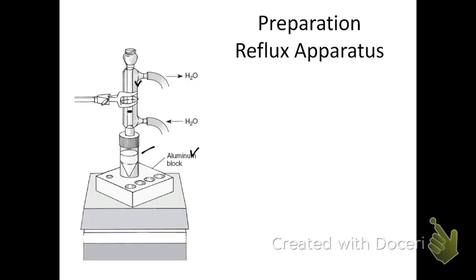That's kind of the double-edged sword, because really what you want to do is get the reaction hot and allow the reaction to proceed to completion, or towards completion, as much as you can. But at the same time, if you make it too hot, bad things can happen, like loss of product, decomposition of product, or loss of material during the reflux.